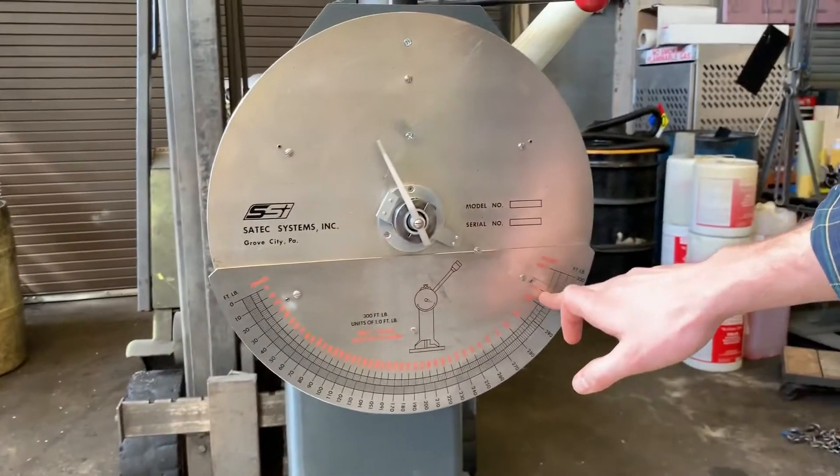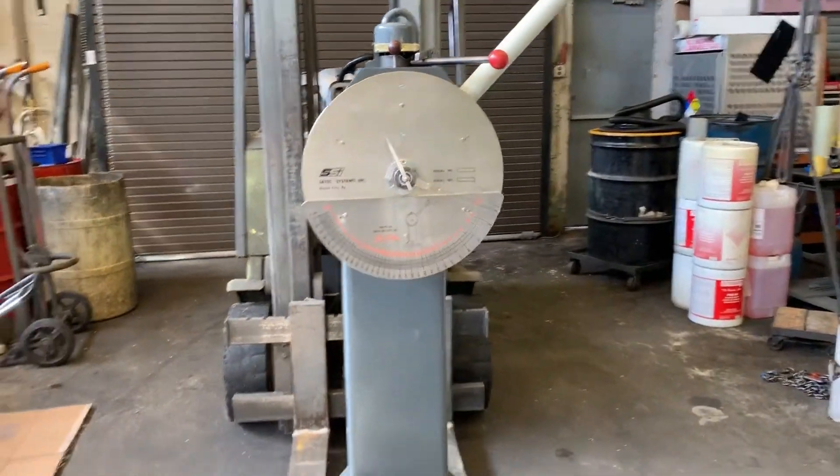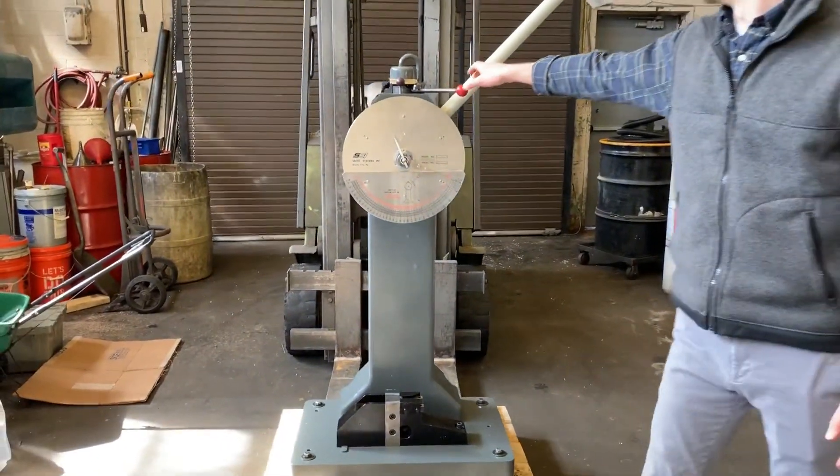We're going to zero this out. Stay clear so we can pull the lever here and run the test.